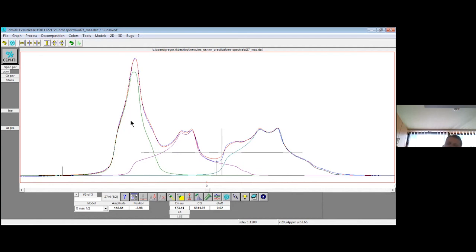But measurements of them, although they can be quick, are still more tricky. One thing is that we have to take more care to be quantitative than with simple spin 1/2 nuclei. The other thing is that analysis is more difficult, because the line shapes that we use in fitting the experimental spectrum can deviate from the ideal line shapes, because the excitation of nuclei is not ideal.